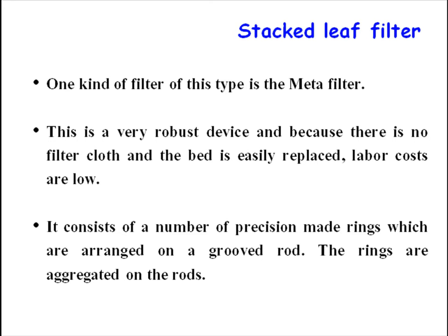Third is the stacked leaf filter. One kind of filter of this type is the metafilter. This is a very robust device, and because there is no filter cloth and the bed is easily replaced, labor costs are low. It consists of a number of precision-made rings which are arranged on a grooved rod.